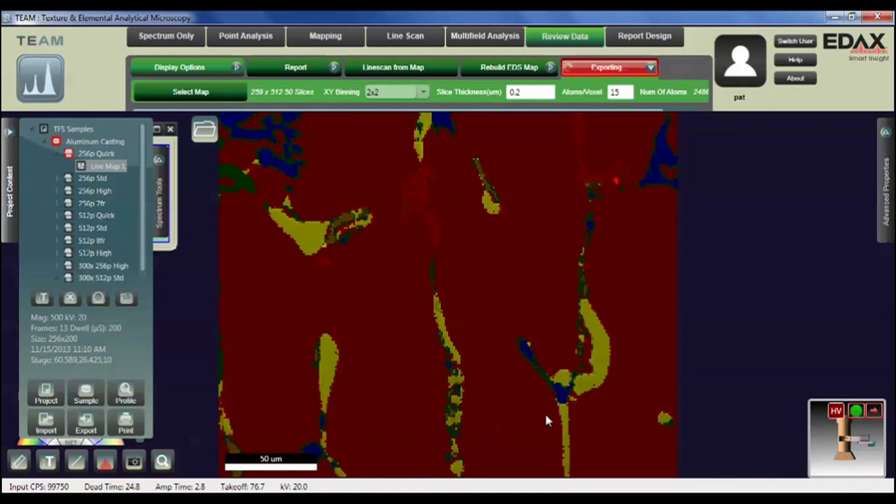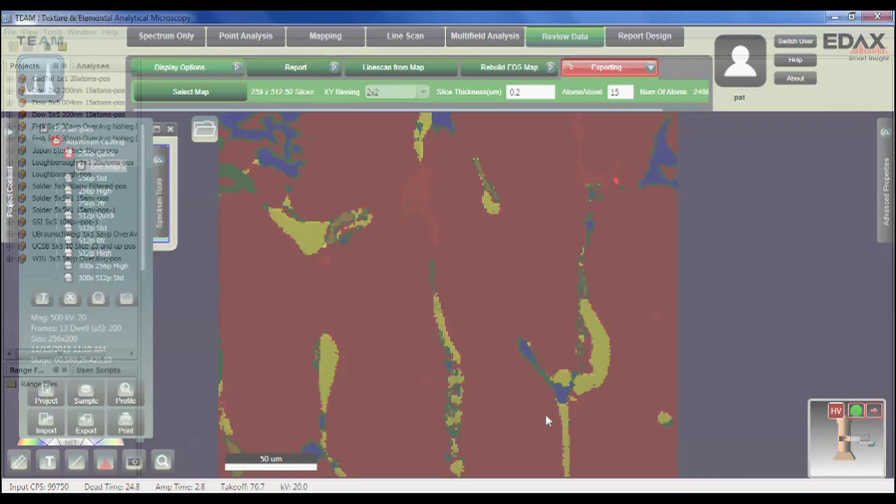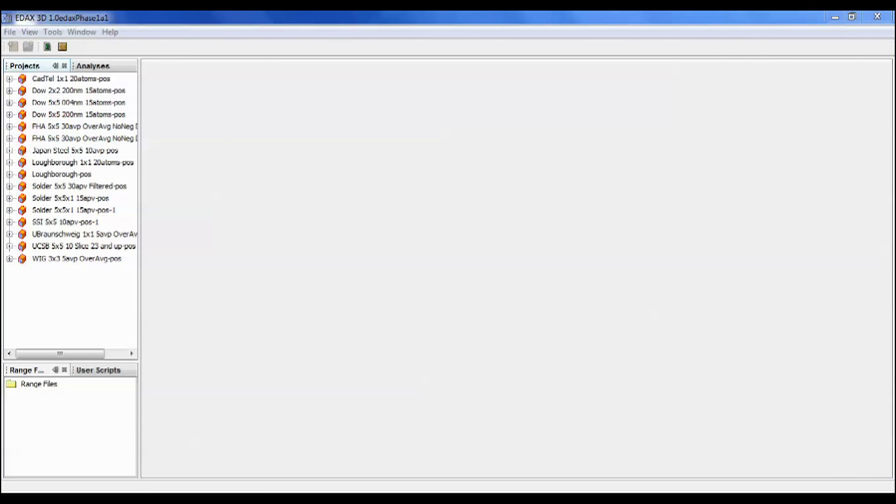Hit enter and now it will do the processing of performing quantitation. And now that the TEAM software has combined all of the individual slices into one POS file, now what we need to do is analyze that POS file as one unit to understand the three dimensionality of the elemental x-rays in the structure.